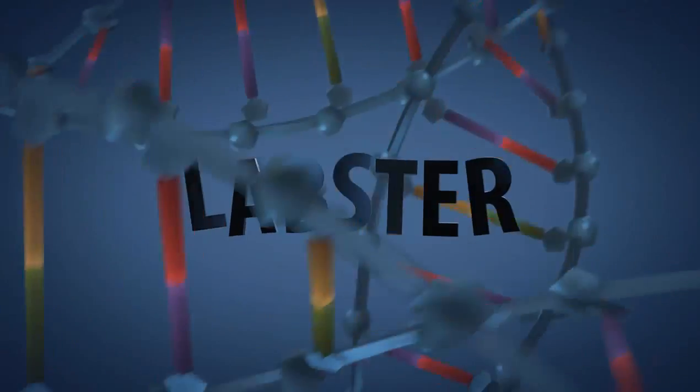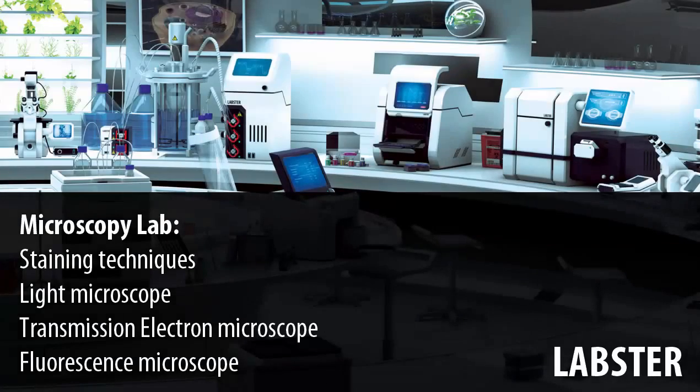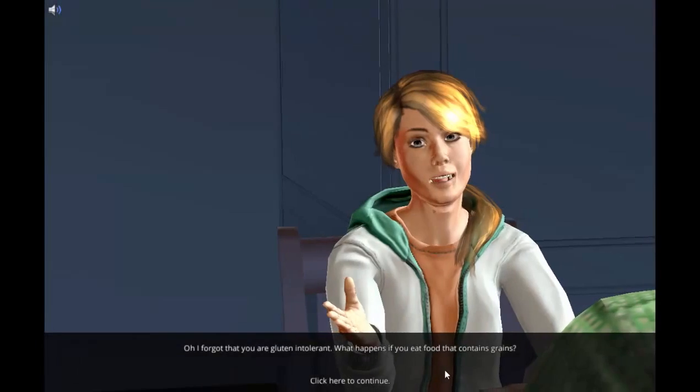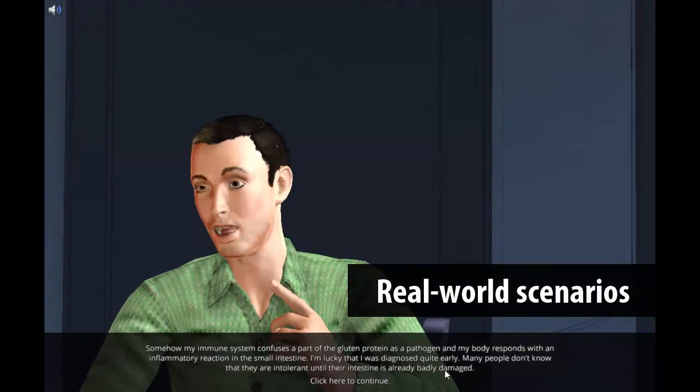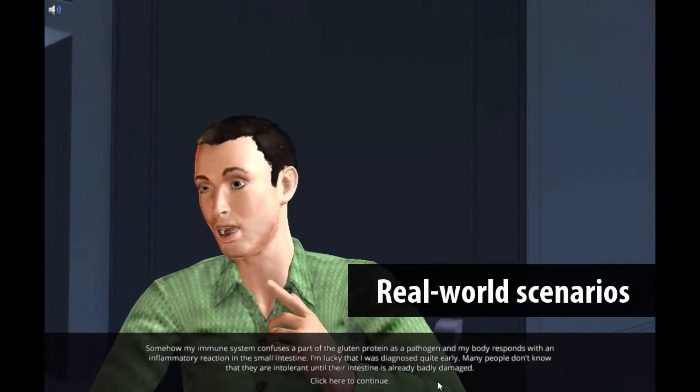Welcome to the Labster Microscopy Lab, where students investigate intestinal malabsorption syndrome using three different microscopy techniques. Students are presented with a research project investigating a syndrome similar to celiac disease.